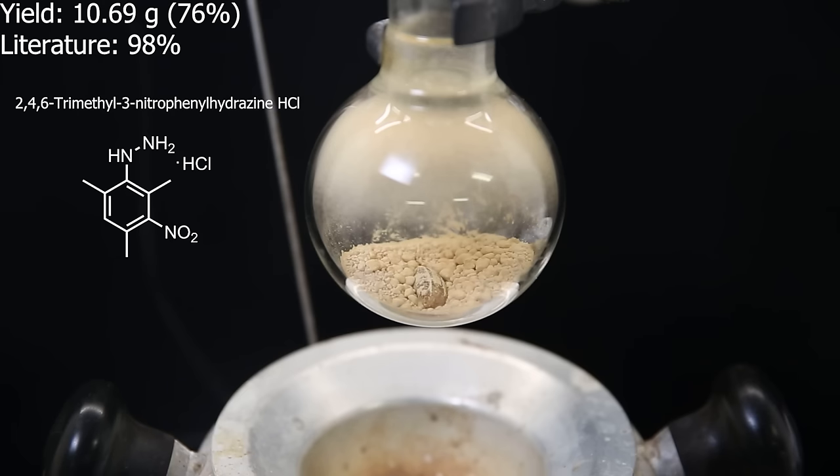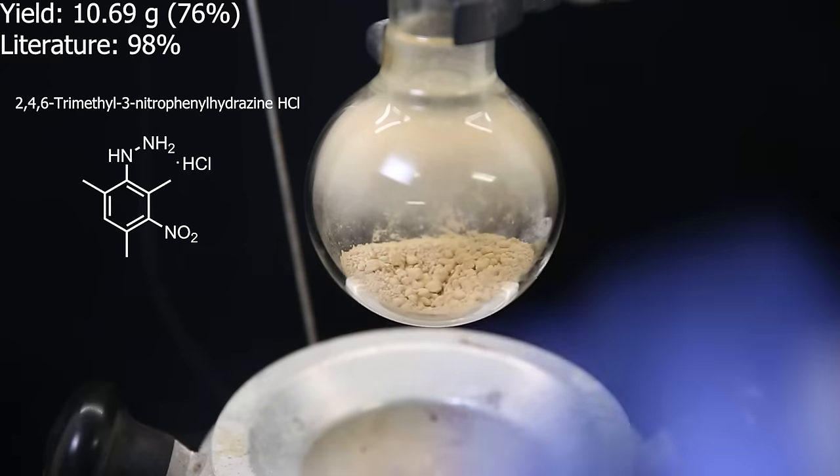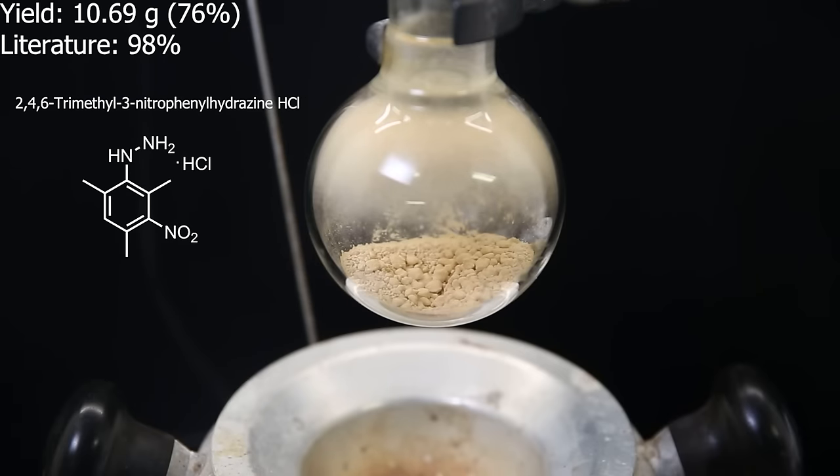The yield of the hydrazine salt turned out to be 10.69 grams, which is 76%. It is a bit lower than the literature, maybe because it was foaming so much. Anyhow, the yield isn't that bad, and I can continue with the next step.